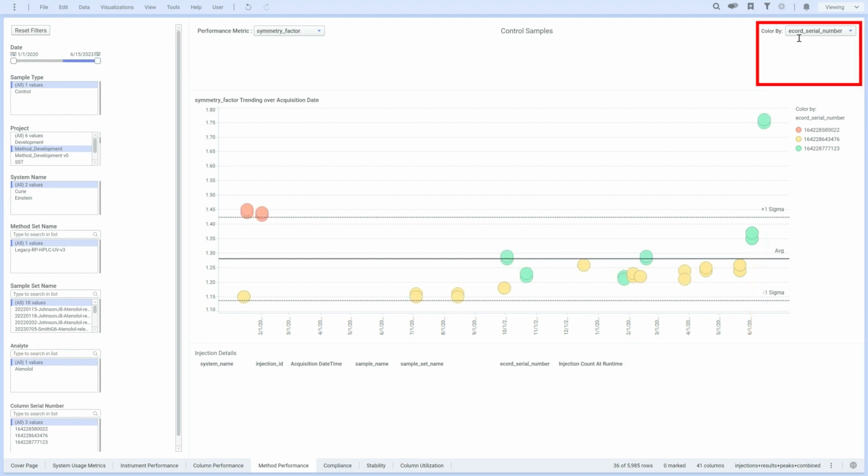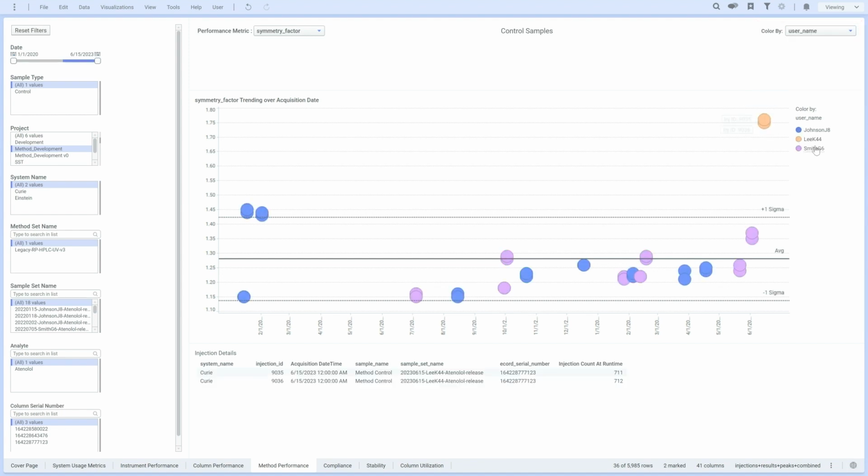After changing the colors to match the users in the dataset, we see three users in recent history, and that the failing run under investigation was conducted by a new user. We might hypothesize that this is a largely isolated incident, instead of a systematic issue with the method or equipment. We should talk to the new analyst as a next step.